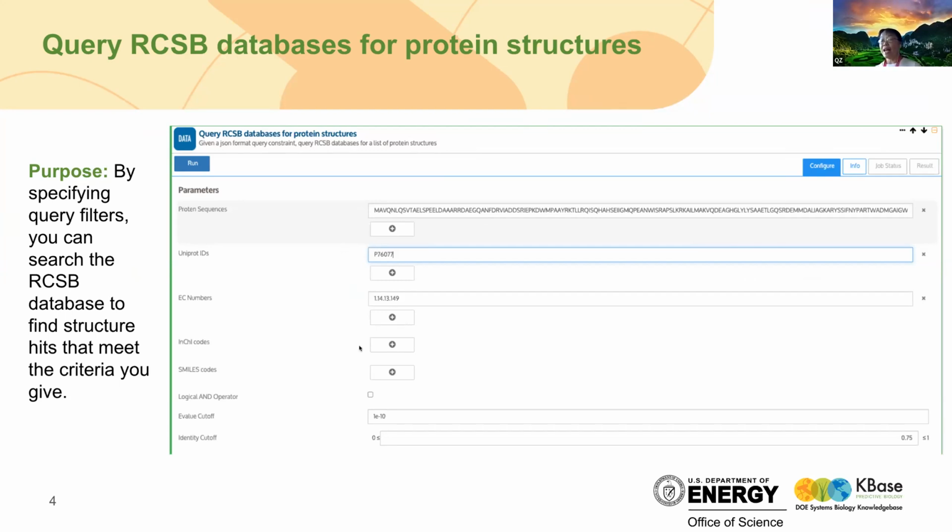But what I have currently installed is that you can search by sequence, by protein sequence, by UniProt ID, EC number, and you can use your chemical InChI code, SMILES code, and maybe some more. Notice here you can add multiple searches. Each one could be combined with a logic AND or OR, and it's built in.